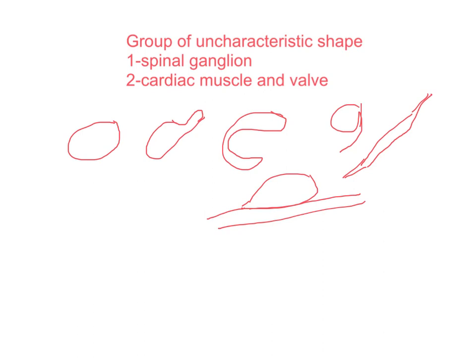So it has many shapes, but it has a very characteristic structure under the microscope.